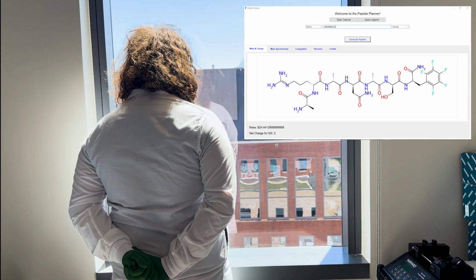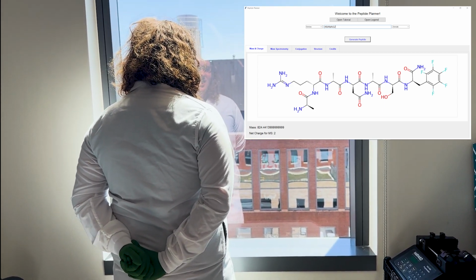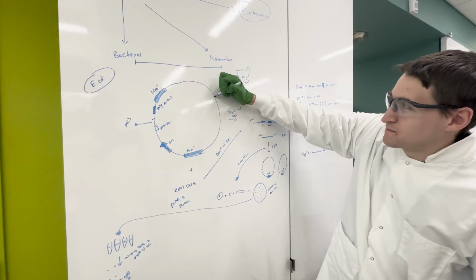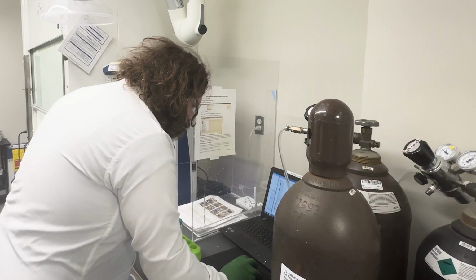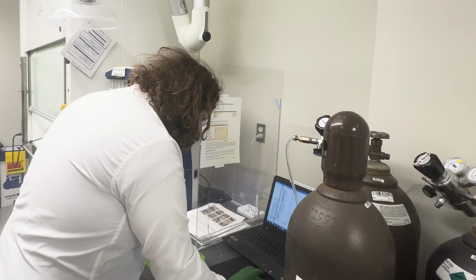This all allows Medina Lab to be able to utilize the Peptide Planner app to verify the samples that they are creating within the lab, as well as help to get newer students up to speed. From this, we have completed our project goal of creating an application that can allow researchers within Medina Lab to understand properties of the peptide made. This allows the user to verify their created peptide and to better understand how further modifications can be made.